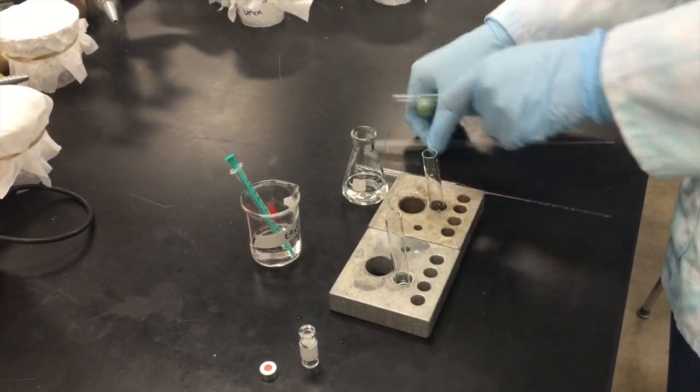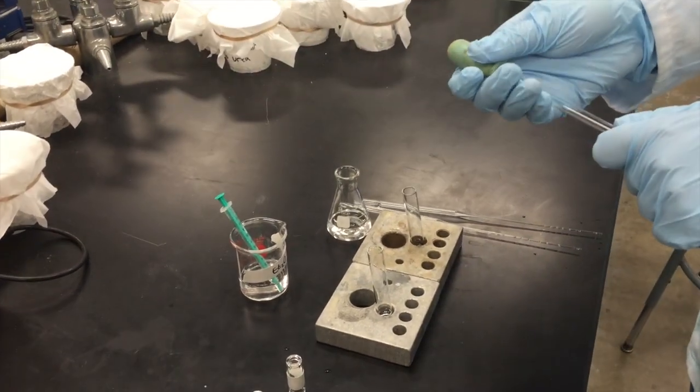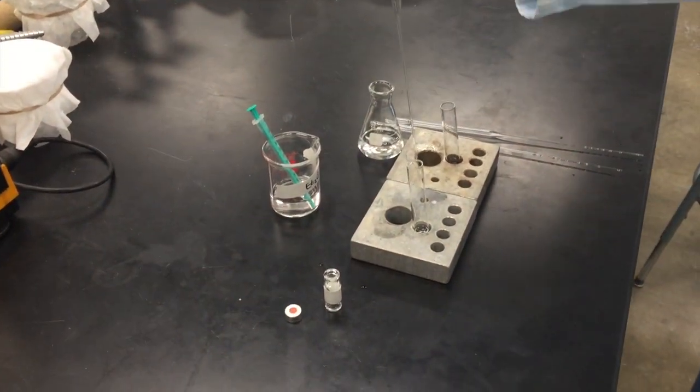Using a new pipette with an amber bulb attached, transfer all the solution from test tube two into a GC vial.